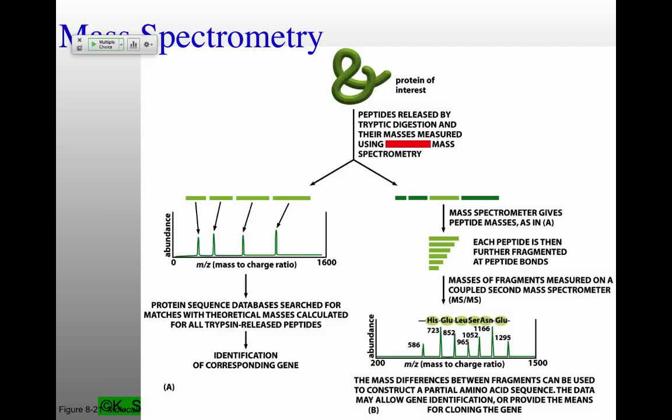The way this is done, again, you cut that particular spot out, it's a protein of some kind, then you want to figure out what that protein is. And the way that's done is through mass spectrometry. Mass spectrometry can look at the mass of an individual protein. That's pretty rare. Mass spectrometers are much better at looking at smaller pieces of proteins, so individual peptides. And mass spectrometers have gotten so good, literally over the last 10 years, that a particular peptide is completely unambiguous, and even some of the modifications that happen to some of these peptides in terms of the absolute mass that you get.